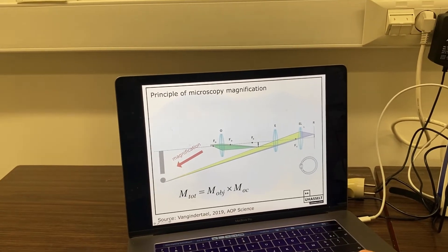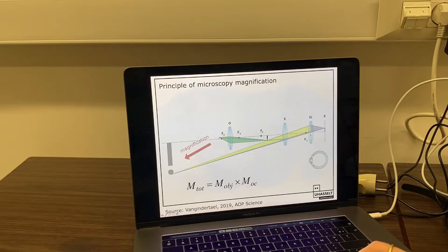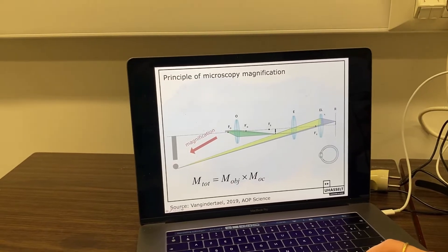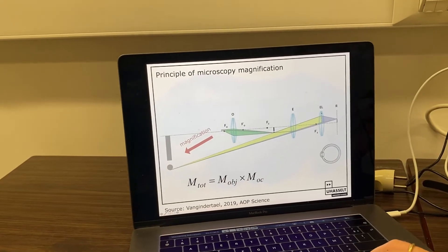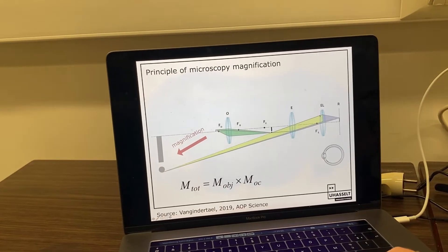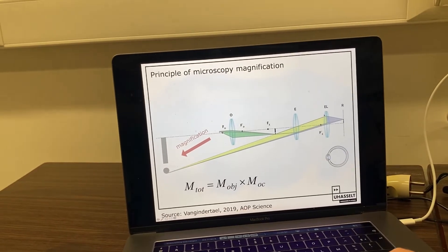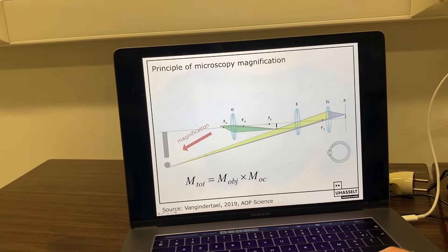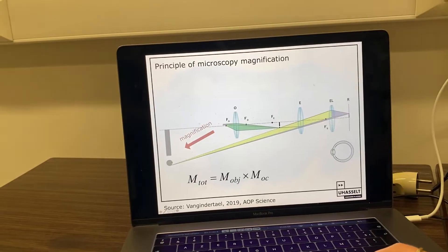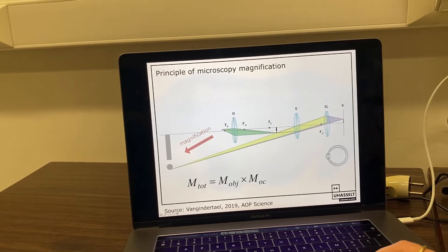Instead of our eyes, we can of course also directly place a camera that observes the virtual image.